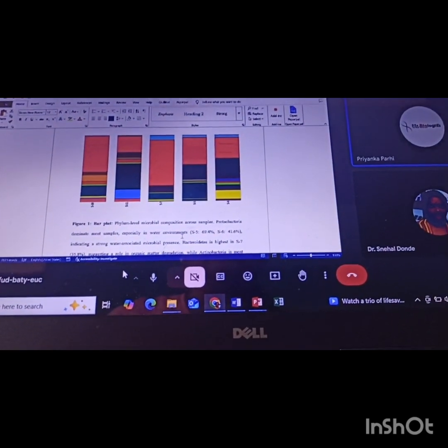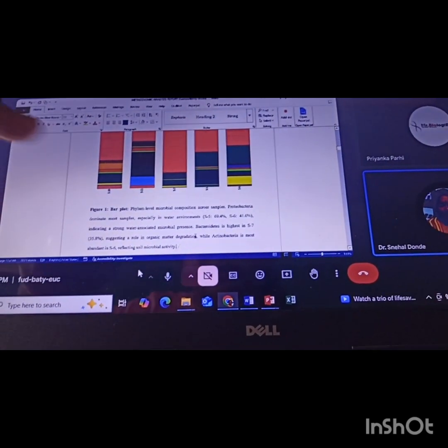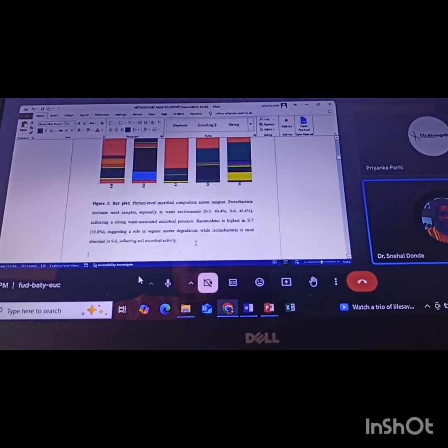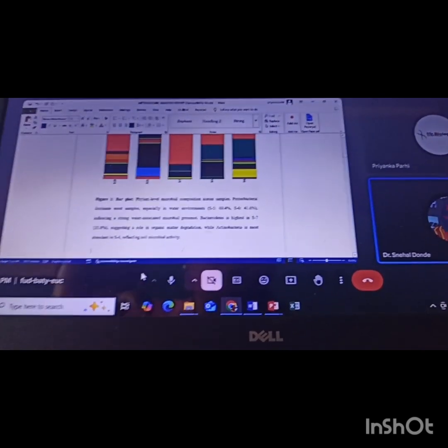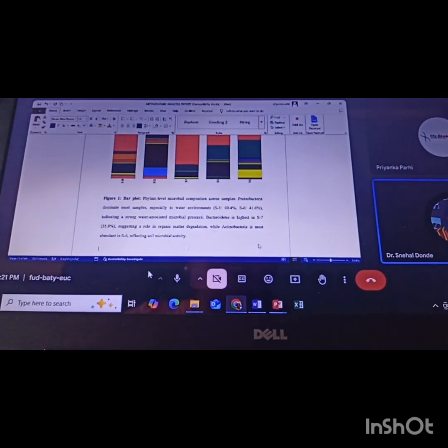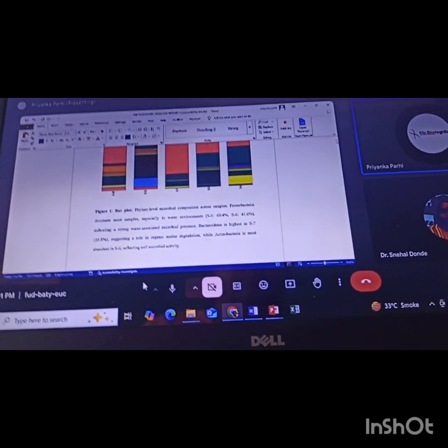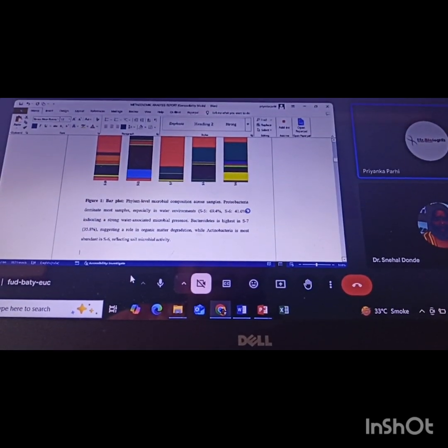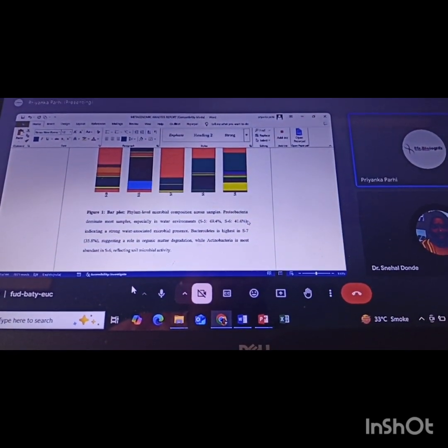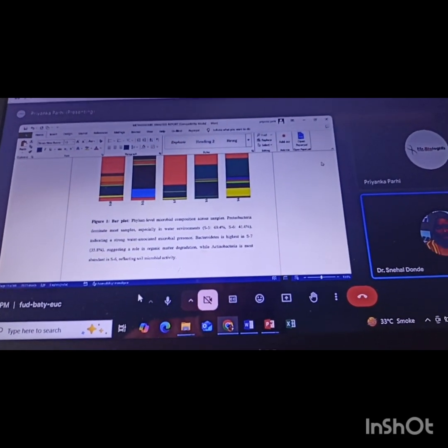Normally we see that this red, the center one, I think S7, is showing a lot of red. So maybe that stands for some particular genus or species. It might be proteobacteria. I think I have the bar plot also. It would help if the color was labeled, like blue stands for this, red stands for this, something of that sort.